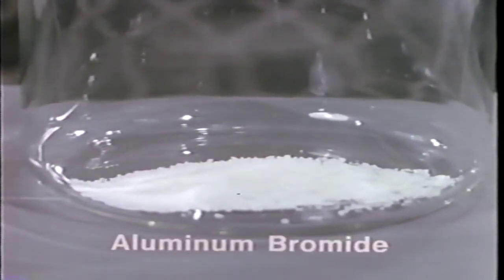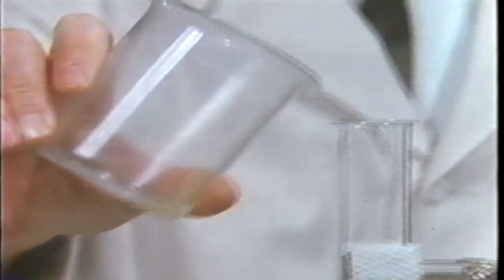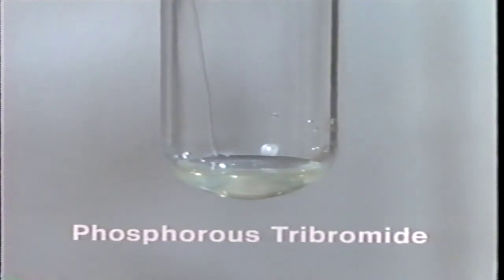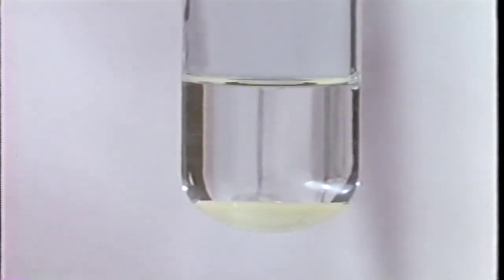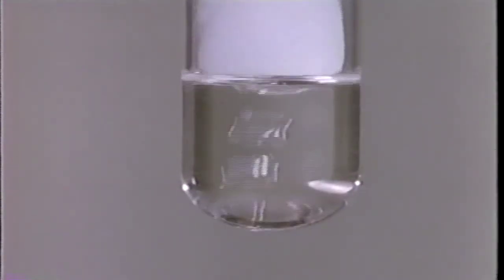Is this bromine compound soluble in water? When water is added, a vigorous reaction occurs. Bromide ions are released into the water. Here's the purified product from the phosphorus and bromine reaction. Phosphorus tribromide, a liquid. Again, we'll add water. The reaction starts slowly, but soon gives off so much heat that bubbles of steam are formed. The reaction continues until all the phosphorus tribromide is gone, again releasing bromide ions into the water.